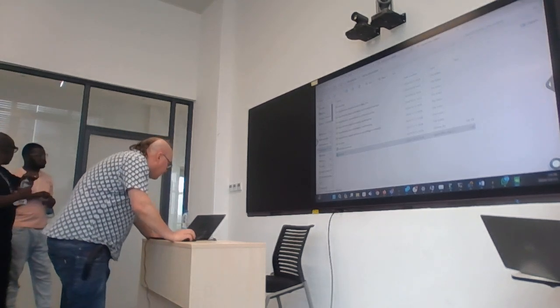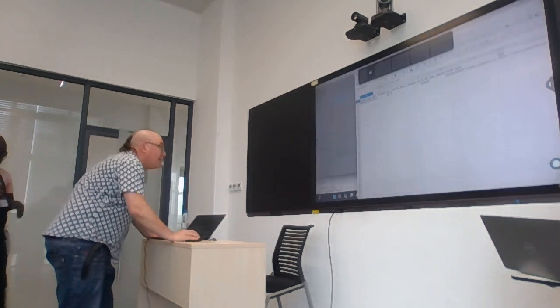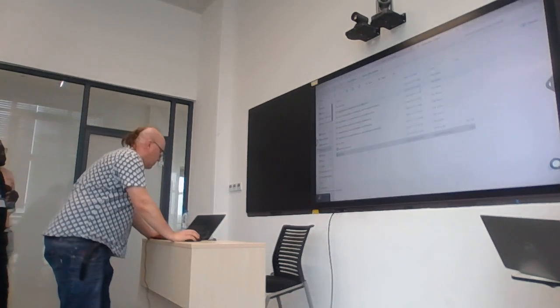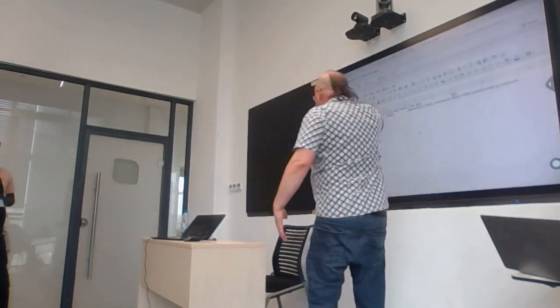Okay, so if we look at this file, it just gives us some basic statistics about this analysis, okay? And this is kind of boring because we've got one sample, right?